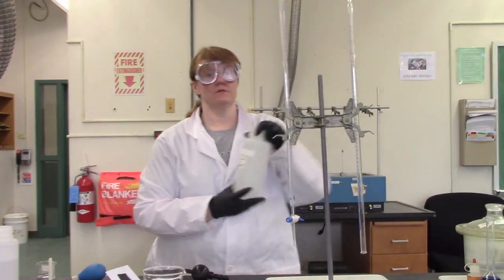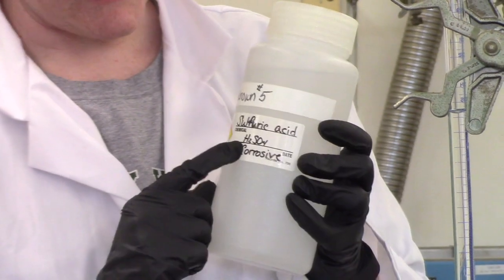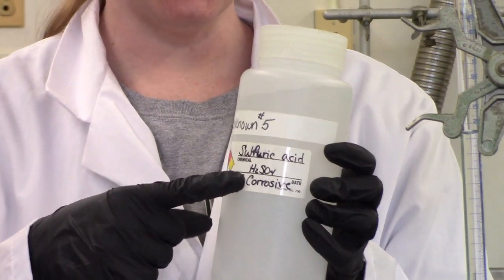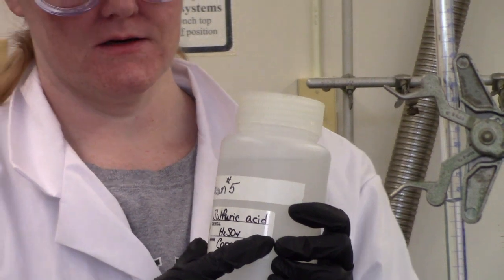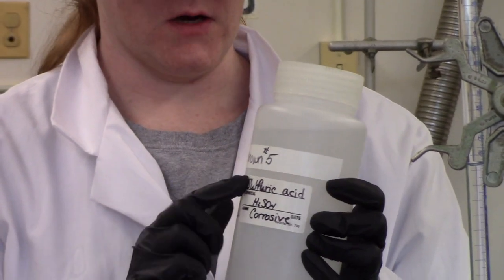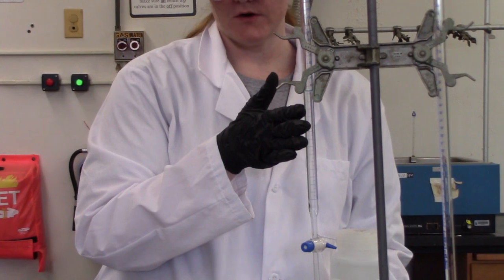So what you need to do when you get to this, so I'm in part five now, is write down the unknown number and write down the identity. So we know what acid this is, we don't know the concentration of it. So that's what you're trying to calculate. You do need to know what the acid is to write the reaction. Okay, some of them are 1:1, some of them are 2:1. So you gotta write that down, don't forget it. But you're still gonna have the NaOH in your buret, so that part's not different.